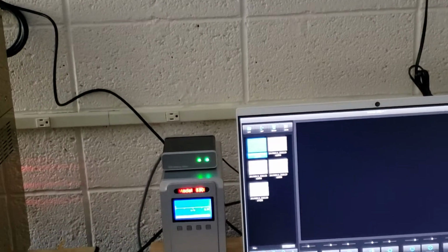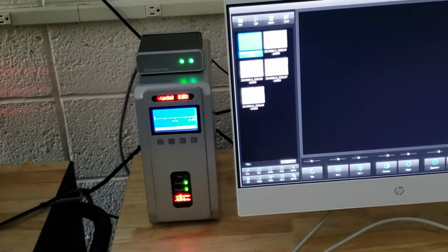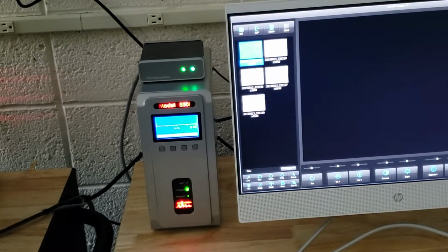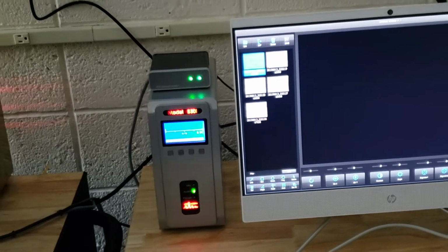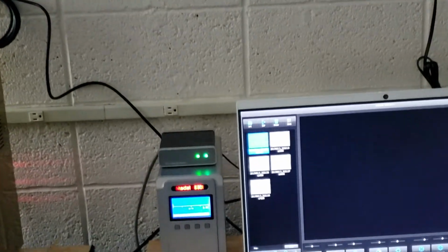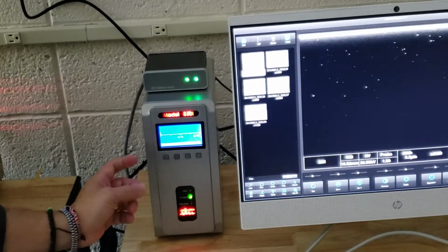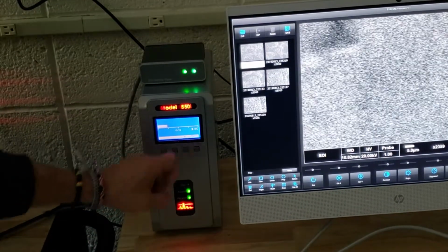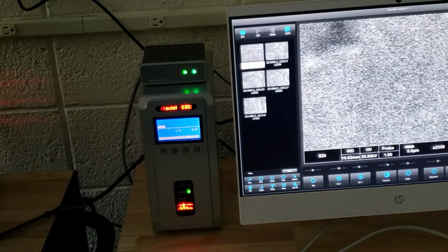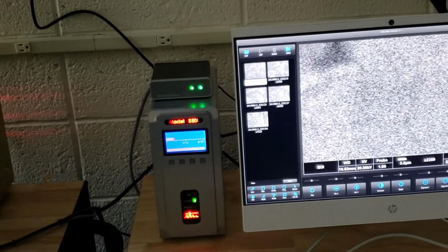Also, there's a graph on there. It says C/S. You see where it says C/S here? And it has 1K over there. That stands for counts per second. That's an auto scaler. As soon as the electron beam is on, that will start moving. So if I turn my electron beam on, all of a sudden we'll start getting a very slight bar graph, and it's moving, right? It's telling me right now, if that's a scale of 1,000, that's 500, we've got around 400 counts per second. So if we have any questions, we know we got a beam there.